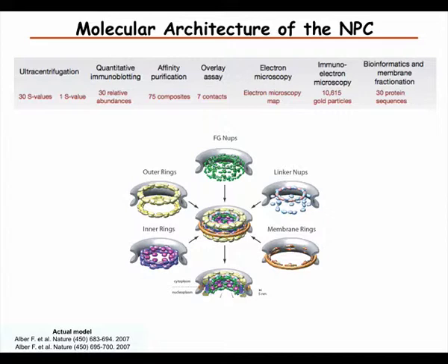And also, sometimes there are, of course, constraints that are contradictory, so you have to sort that out, and then you have to put different weights on different kinds of constraints that come from different experiments.